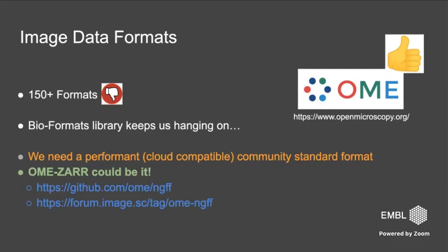What keeps us sort of still hanging on is the heroic effort of the OME consortium. They maintain this Bio-Formats library, which allows you to open all of these formats, but it's really not a sustainable solution. So we really need a community standard format, and ideally now with all this cloud computing, a cloud compatible format, and there's light on the horizon, I would say.